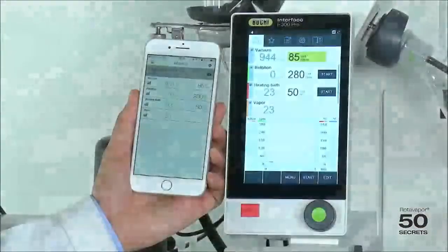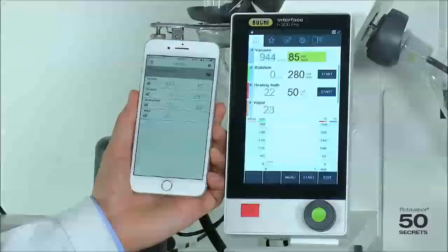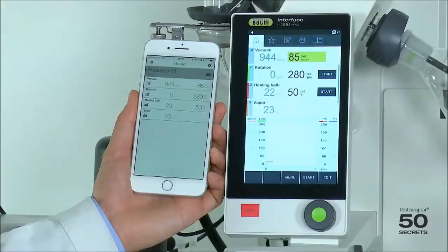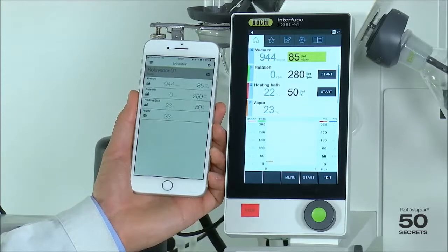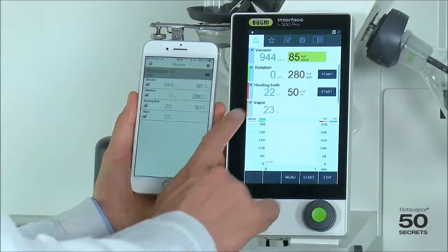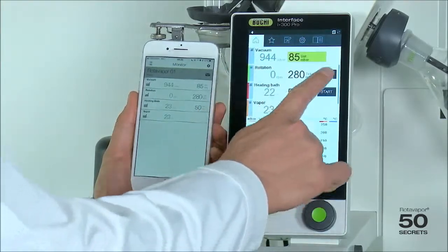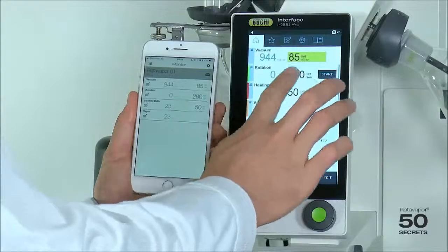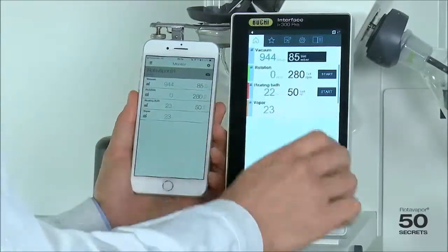Today's secret is about the monitor app. We would like to show you the details of it. After downloading the app from the App Store, you can simply connect it through the QR code and then you can see the live data, which is the same as here on the device.